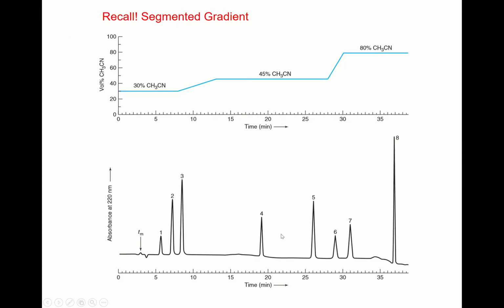Okay, but you have already learned the gradient elution, the so-called segmented gradient, in the first part of this chapter. We already learned the segmented gradient for better resolution, better separation. And this gradient is different from linear gradient.